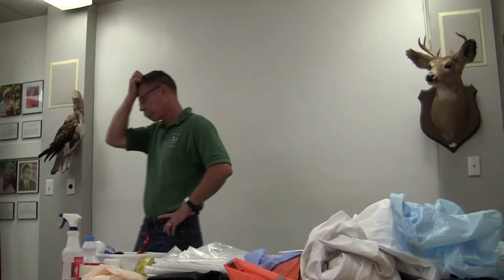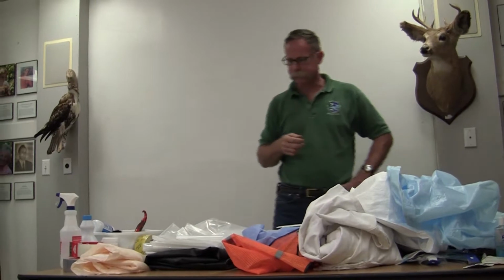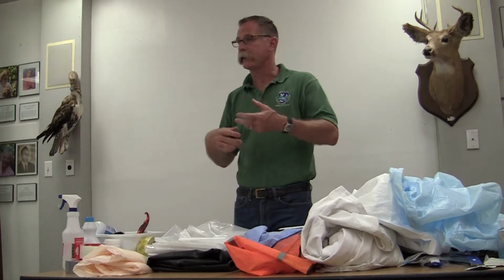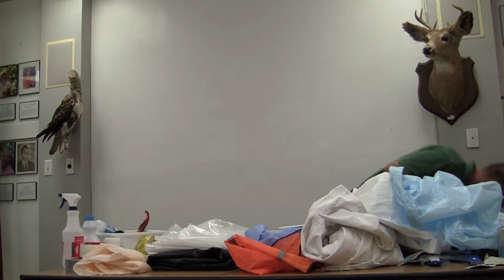All right, so you've got this dead animal that you're going to investigate, and you want to submit it to us so we can see why it died. You want to get that animal to the lab without contaminating yourself, and without contaminating me or Joe or Ashley or John.